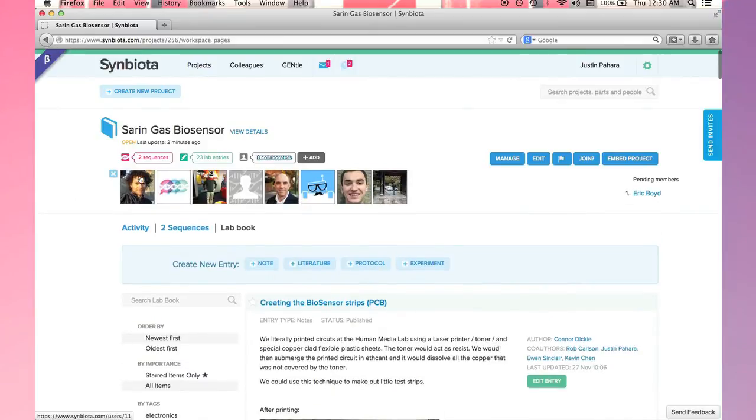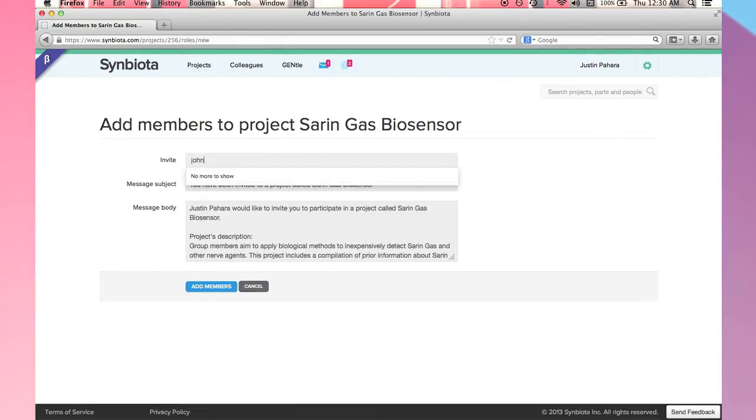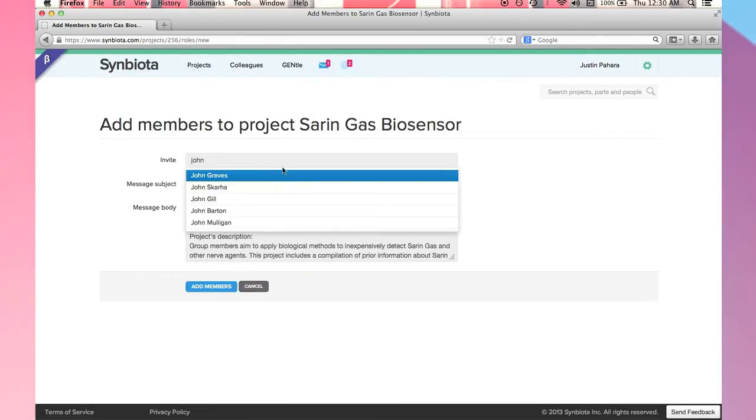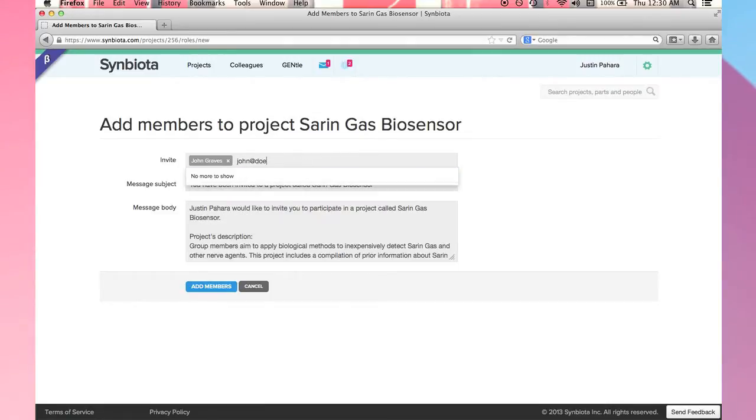To add a new collaborator, I click add. I can enter a person's name if they are already a Synbiota member, or an email address which will send that person an email notification.